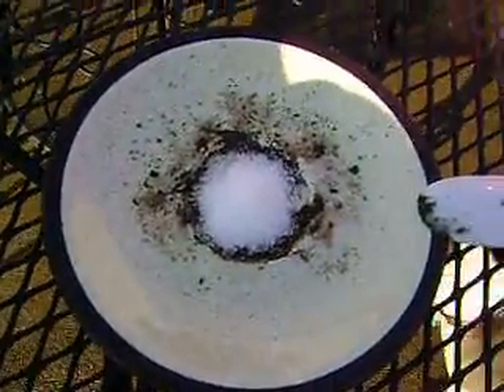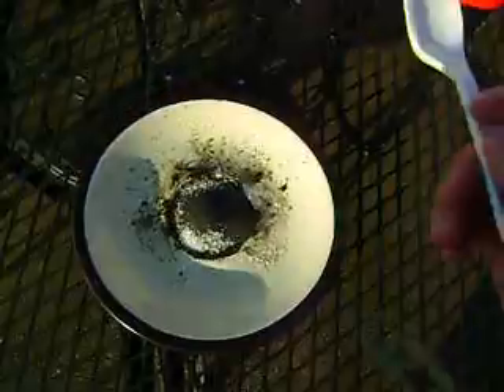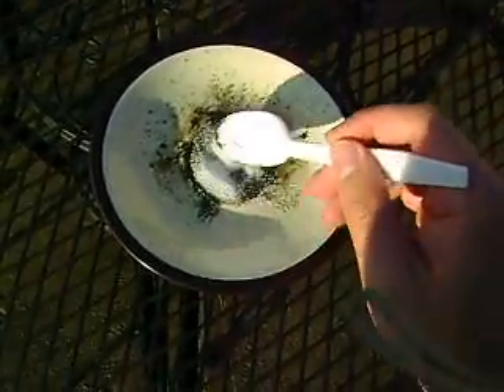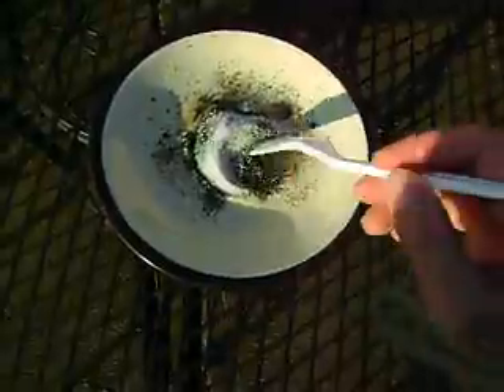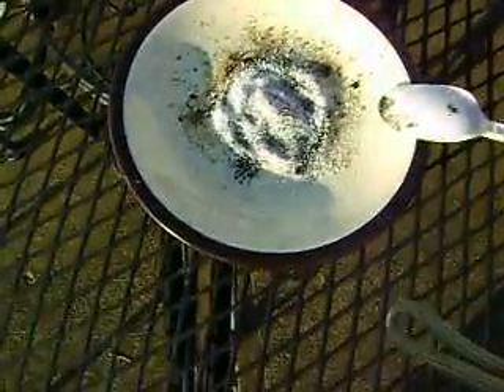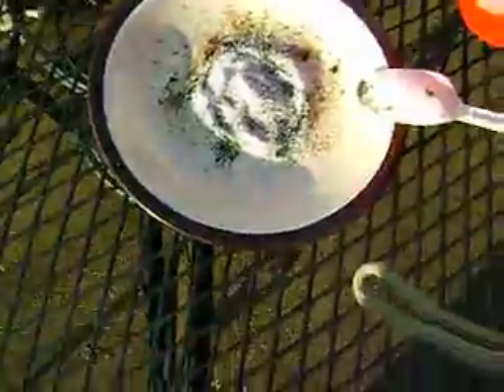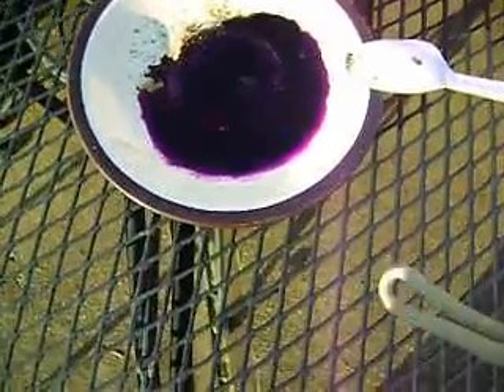We now have a pile of pure granulated sugar in the middle of a ceramic plate. Adding the oxidizer. Now we mix it, mix the two together. Add a little bit of water. The purple being the potassium permanganate.